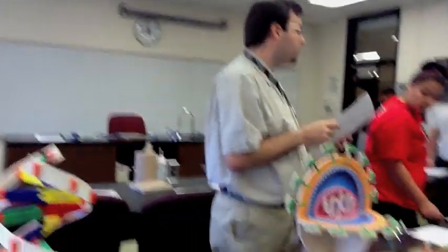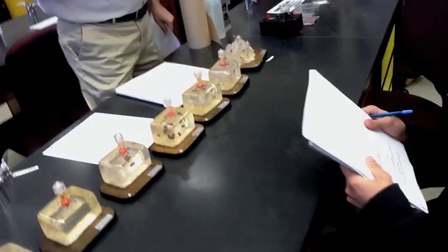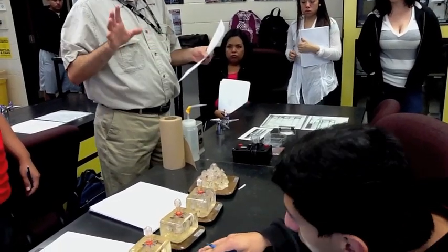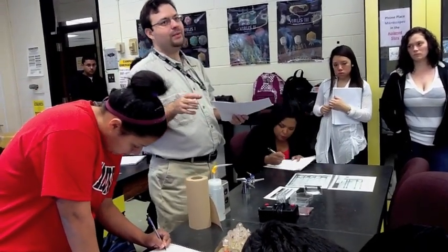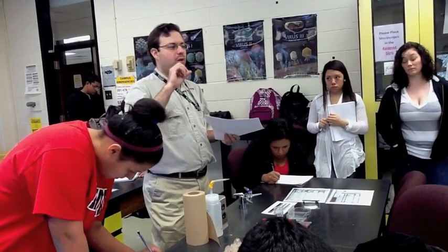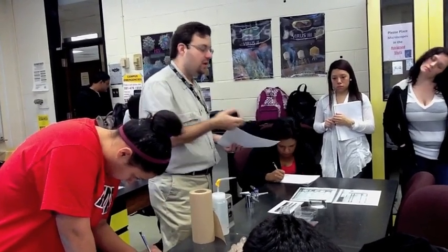Next one is gel electrophoresis. I'm going to skip this, since your report was all over it, so you should know what's going on here. The only thing you may need to add is to know what PCR is, which is polymerase chain reaction. That's where we take the DNA and duplicate it several million times so we have enough DNA to actually run the test with.